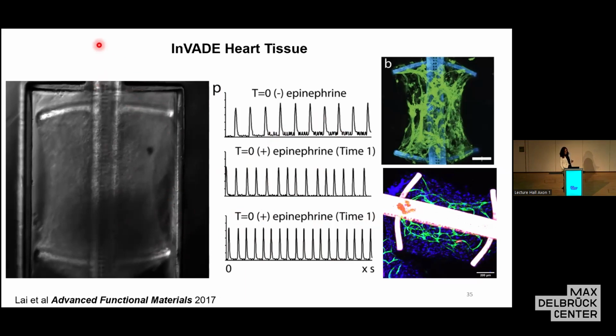And then this conduit here, the channel is endothelialized. And you can see cardiomyocytes. This is troponin T staining. They're spanning the cantilevers. What we are trying to do now is something like this, where you have microvasculature connecting to this larger 100 micrometer in diameter vessel to get more like hierarchical branching.